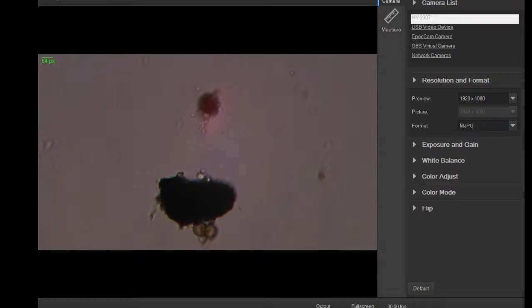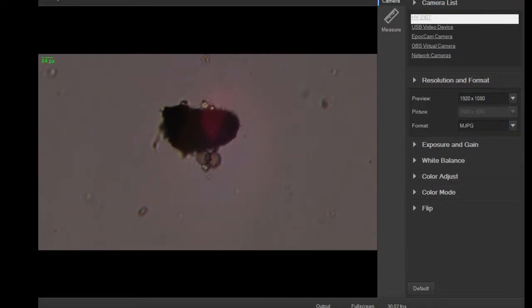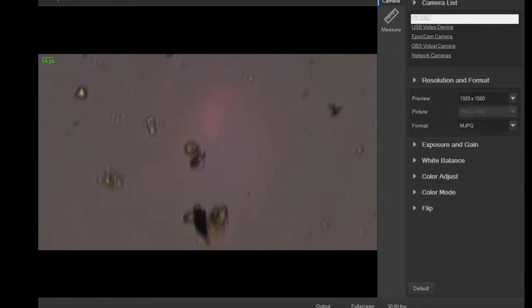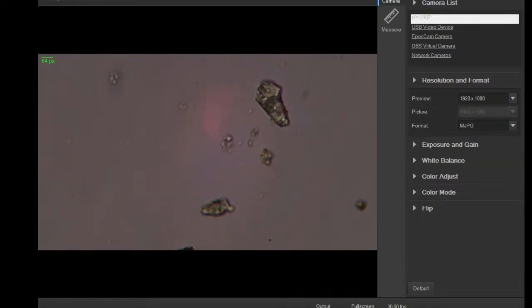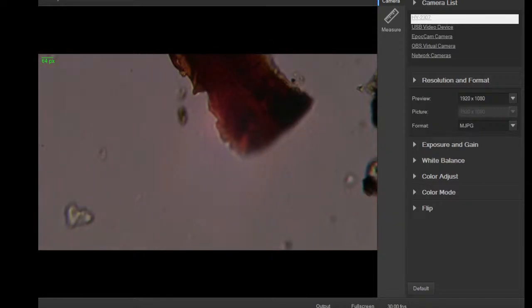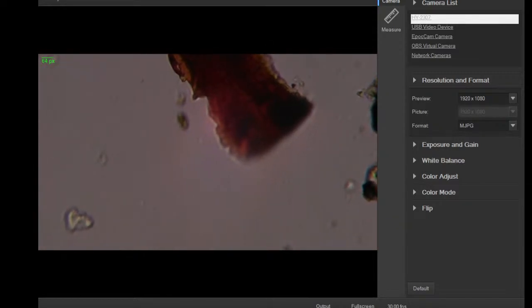There we go. Okay, what is that? A couple of spheres there of something. More debris. Debris. There's a colorful piece of debris. Piece of plant material. It's got some pigment to it. Can't quite make out the color in this shot.